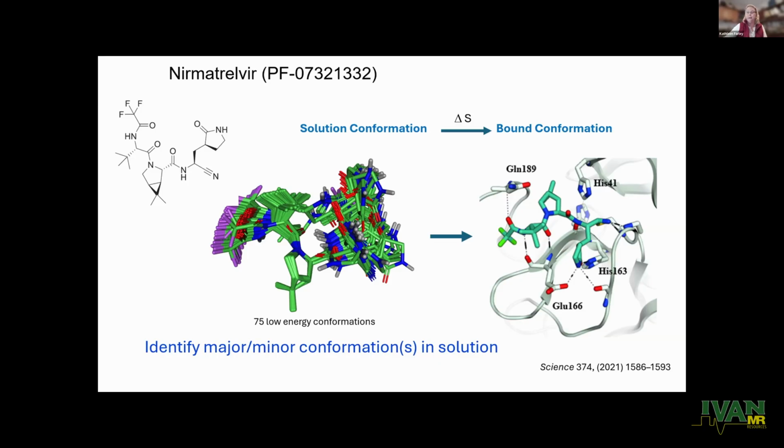Sometimes because the X-ray and cryo-EM folks were struggling and maybe having a little trouble coming up with it as quickly as the team would have liked. And other times it's because the solution conformation isn't always identical to the bound conformation. So it's useful to know with your lead compound what kind of changes you can make to perhaps make it closer to the bound conformation and have the molecule have to spend less energy to adopt that bound conformation. So typically we would have the computational chemists generate a low energy conformational file, and you can see there's quite a bit of motion in this compound.